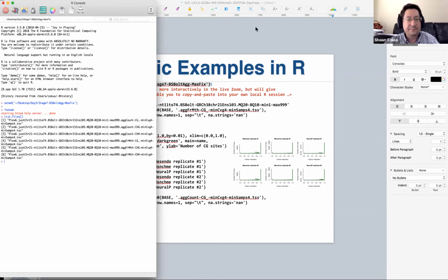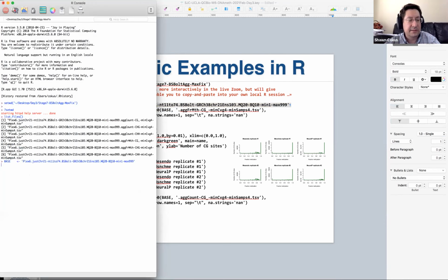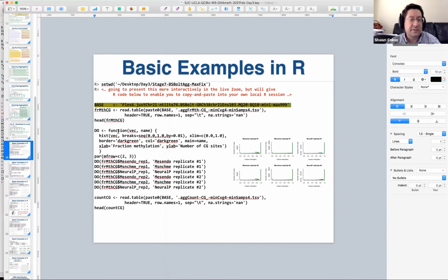Okay, in RStudio, I think there's a little GUI thingy you can click somewhere and do it, but it's going to run the same command inside. Okay, and because these file names get long, I'm going to make an R variable that just contains a long part of the file name. And hopefully you know the paste0 command in R. That is how you put strings together in R. So paste0 takes strings and puts them together. The reason they called it paste0 is because the one that was already called paste uses a space between them, which is often less useful.